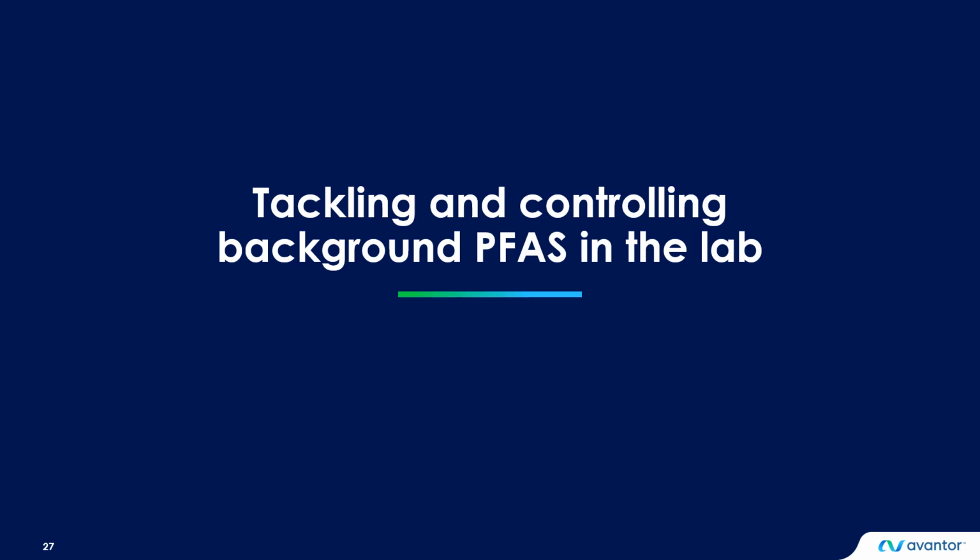So for the remainder of this webinar, we're going to just spend a bit of time discussing tackling and controlling background PFAS contamination in the lab. This is a topic which anyone who is involved with PFAS analysis will have experienced for themselves. It's something that can vary considerably from lab to lab, from operator to operator, and even from day to day, and can at times be immensely frustrating. So hopefully some of the topics that we'll discuss here will be of use to some of you.